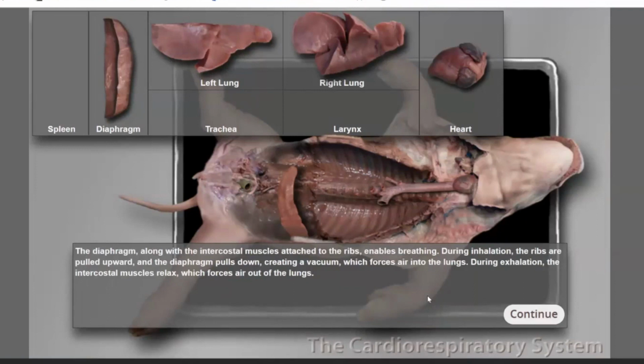So if you've ever seen a syringe, like you take medicine out of, and you push it, things go out. Either medicine goes out, water goes out, or air goes out. Whereas if you pull it, air goes in, or medicine goes in, or water goes in. That principle is based on pressures. So when your diaphragm is relaxed and it's like a dome, it pushes air out because the pressure in your chest is greater than the pressure in the outside world. So the air that's in your chest runs out to try to equalize those pressures. Then when your diaphragm contracts, the air pressure in the outside world is greater than the air pressure in your chest, so air runs in.